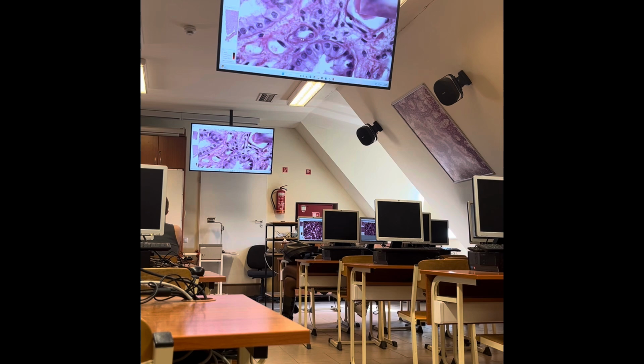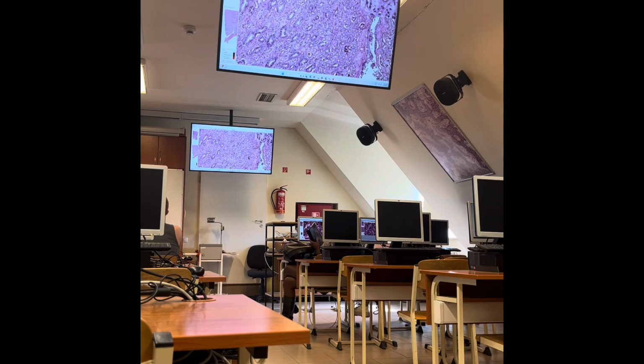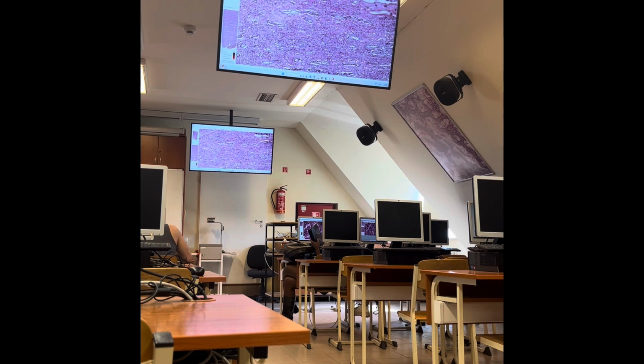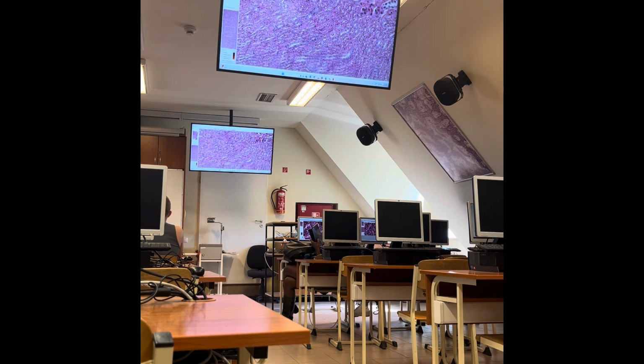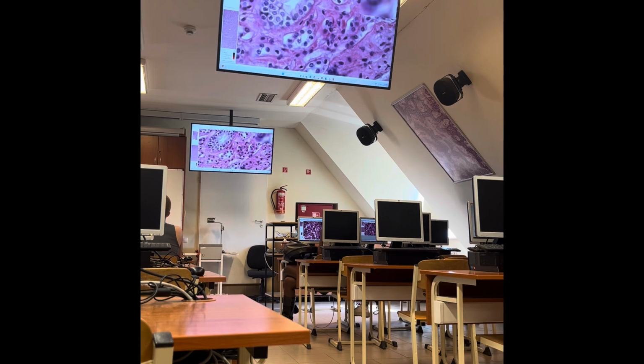So thin segment in the medullary part. And then it returns towards the cortex. So as I travel further, we can identify the straight segment of the distal tubule now. The straight segment of the distal tubule we can recognize based on cuboidal lining epithelial cells, a lighter staining of the cytoplasm, and a more regular lumen.